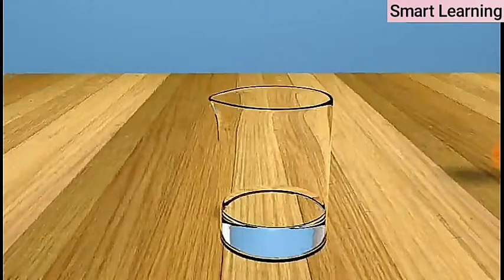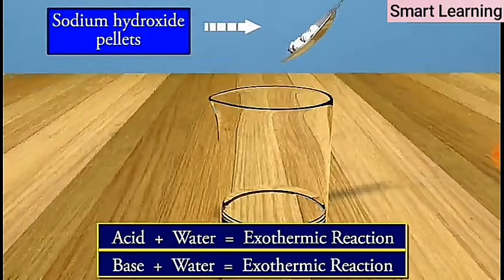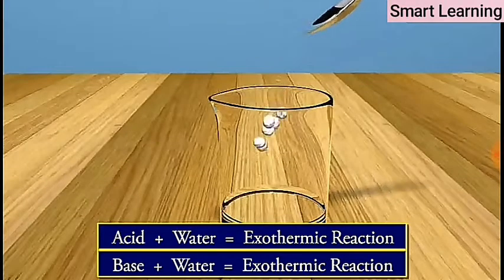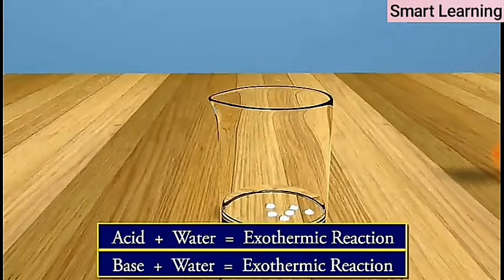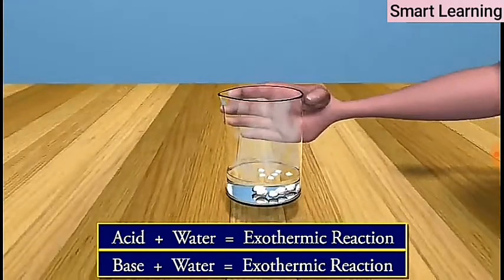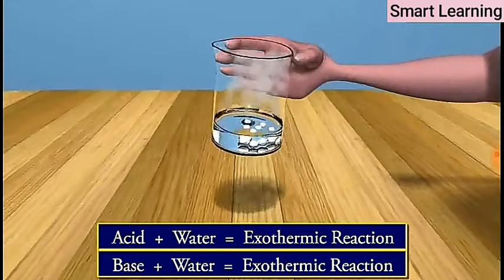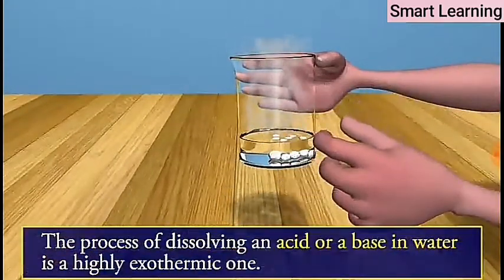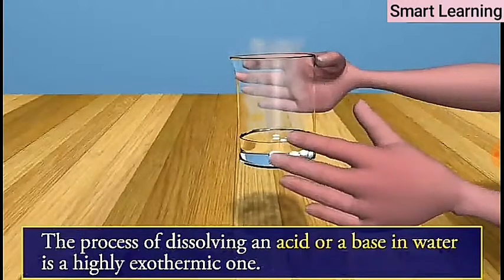Repeat the above activity with sodium hydroxide pellets and record your observations as shown here. From the experiment, we understand that the process of dissolving an acid or a base in water is a highly exothermic one.